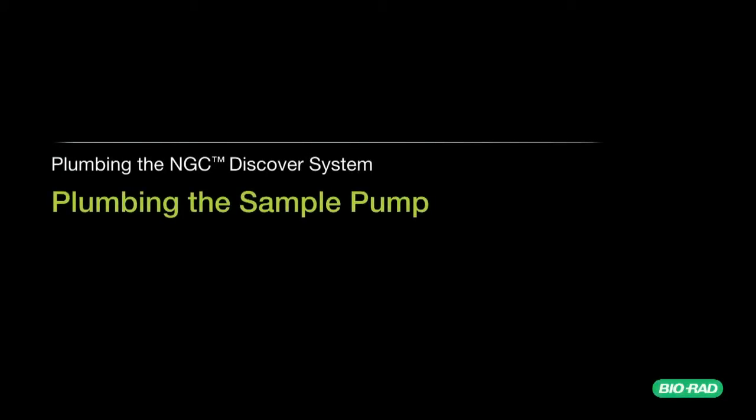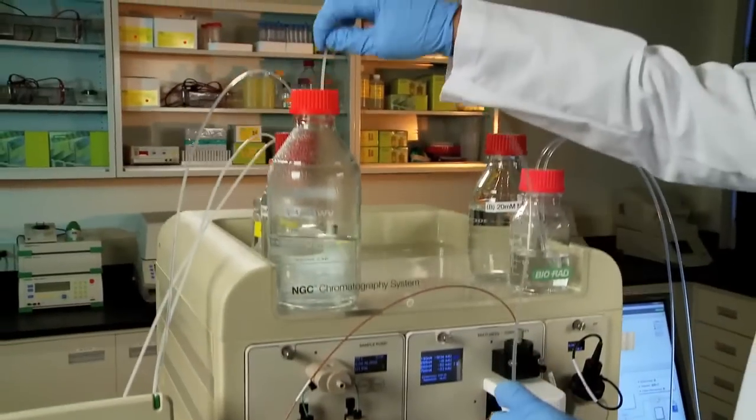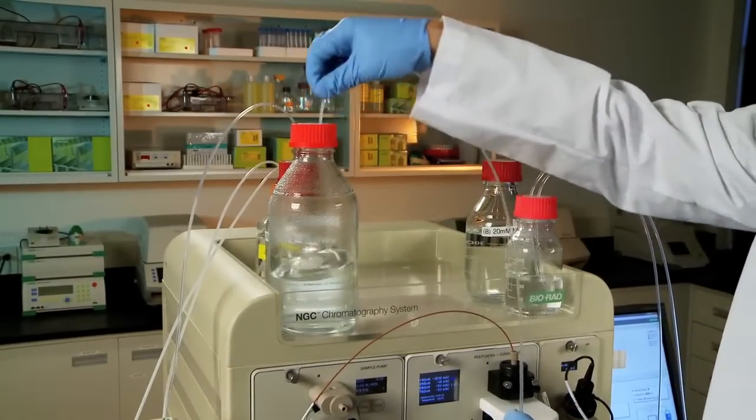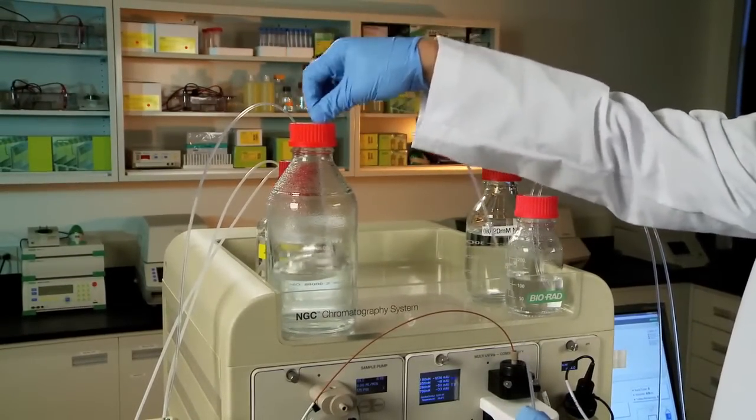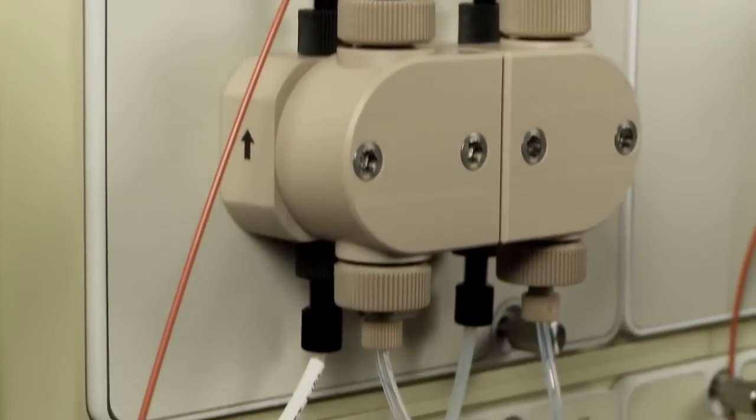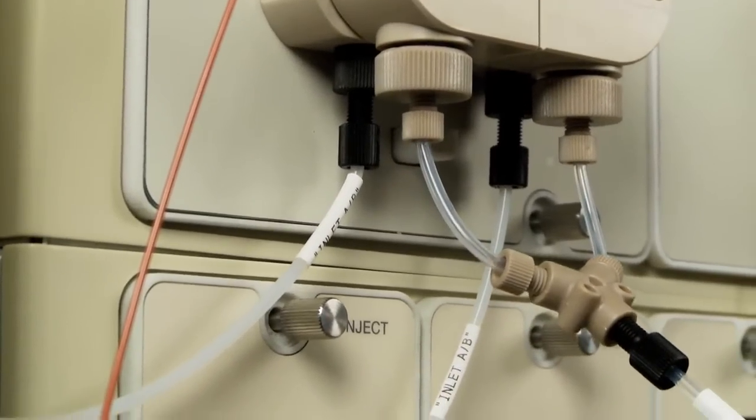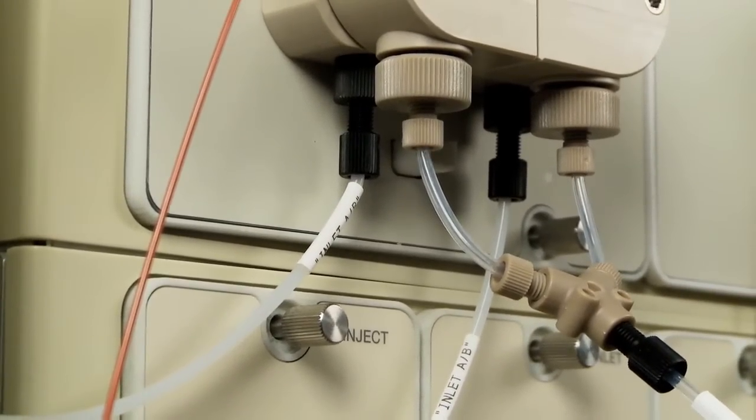Plumbing the sample pump. Connect inlet tubing to the sample pump inlet manifold and immerse the open end of the tubing into the intended buffer bottle. Inlet solvent filters may be used. The sample pump has an automatic piston washing system that requires plumbing to 20% isopropyl alcohol, similar to the system pump head washing system previously covered.